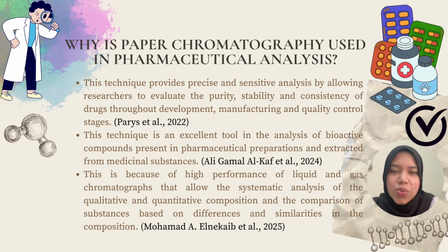Paper chromatography is widely used in pharmaceutical analysis for several reasons. Firstly, it provides precise and sensitive analysis by allowing researchers to evaluate the purity, stability, and consistency of drugs throughout the development, manufacturing, and quality control stages. Secondly, according to Ali Gamal Al-Kaf in 2024, this technique is an excellent tool for analyzing bioactive compounds present in pharmaceutical preparations and medicinal substances. Furthermore, chromatographic techniques enable both qualitative and quantitative analysis and allow substances to be compared based on their compositions.